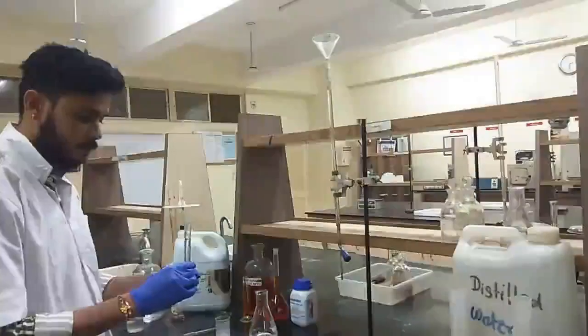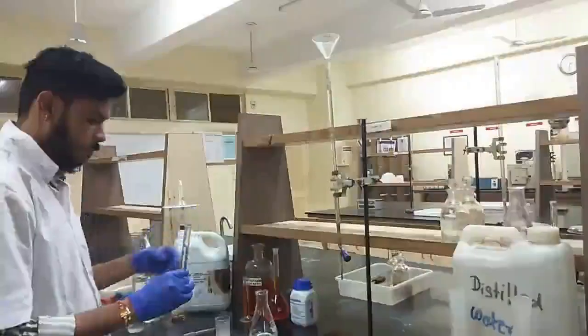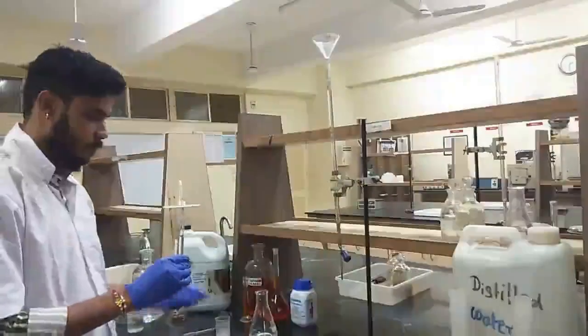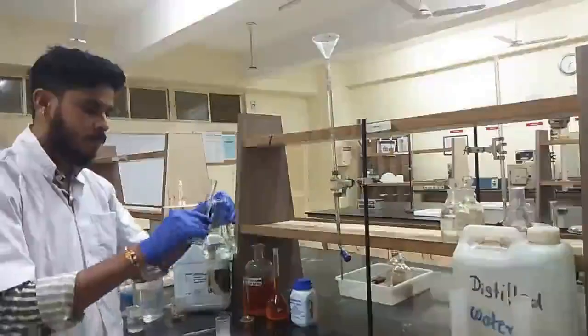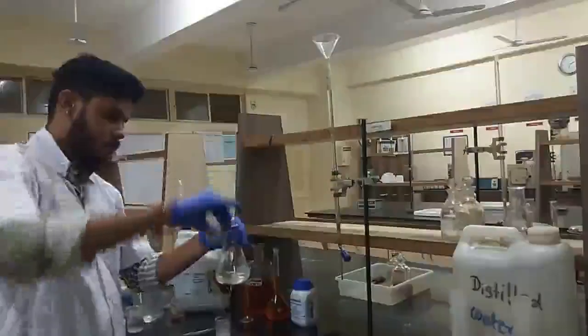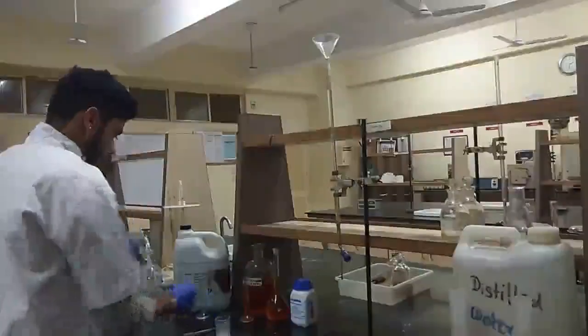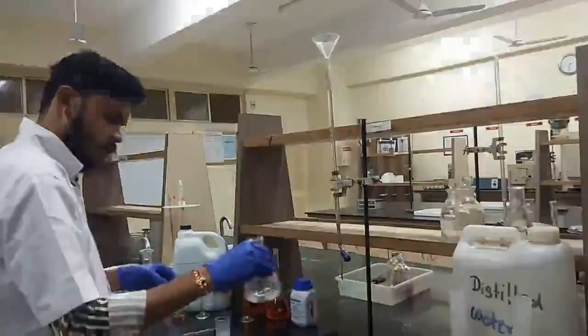So that happens to be 10% H2SO4. So we require only 10 ml. So we'll be adding 10 ml of 10% dilute H2SO4 in the conical flask now. After addition of every substance, the stirring will be required, right? So stirring shouldn't be missed.